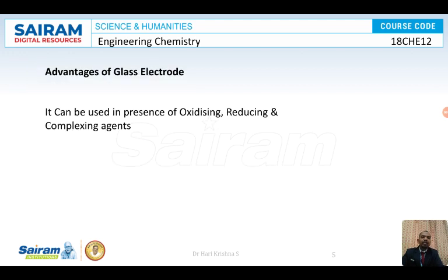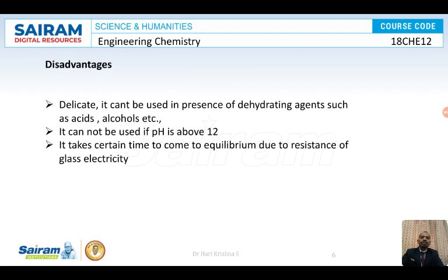Okay, so let us see the advantages of the glass electrode. It can be used in the presence of oxidizing agents, in the presence of reducing agents, and also in the presence of complexing agents. So these are some of the advantages of the glass electrode. If there are advantages, obviously there will be disadvantages also. So what are the disadvantages?